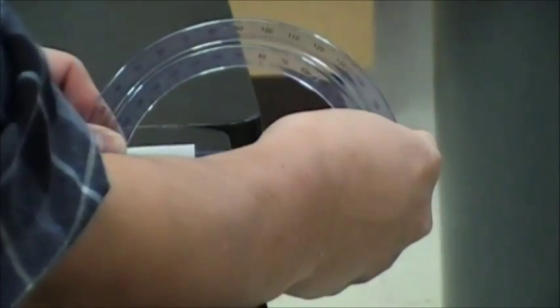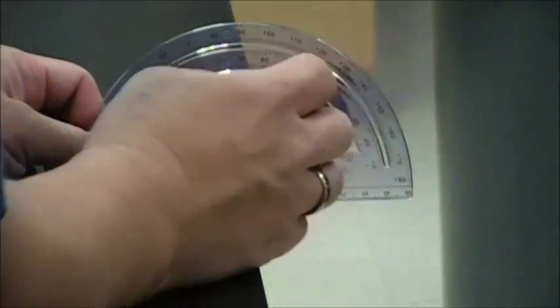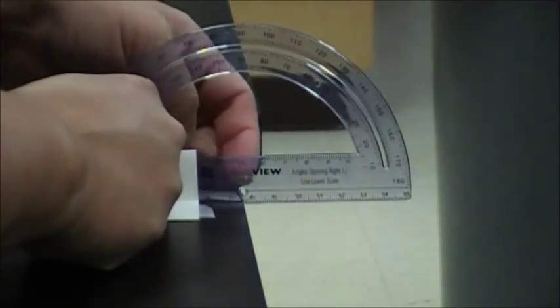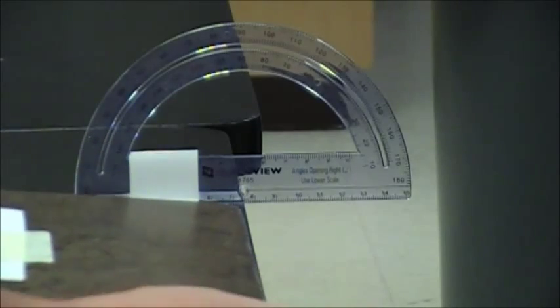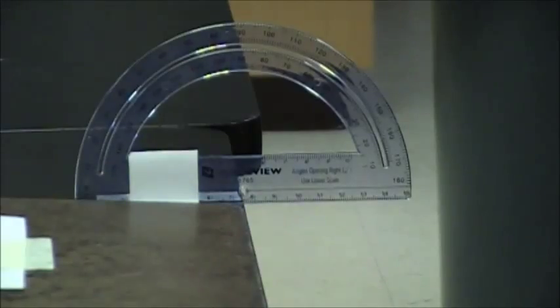Next, set up your protractor so that the middle of the protractor is at the edge of the table. Then tape the edge of your whiteboard to the edge of the table, creating a hinge.